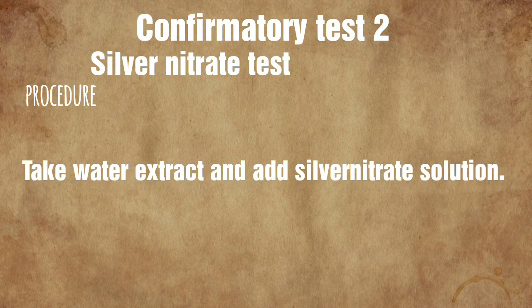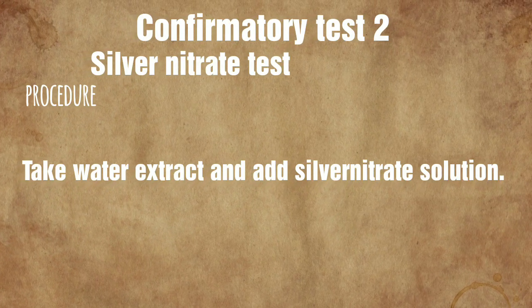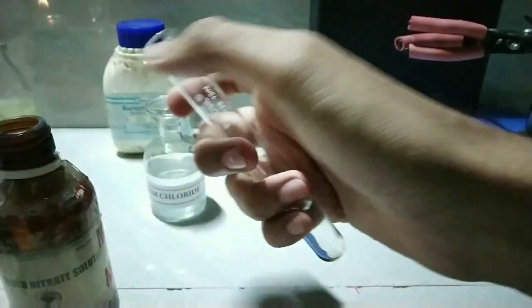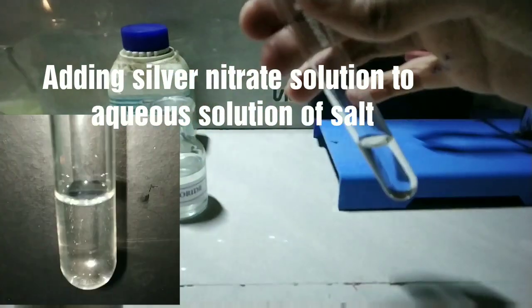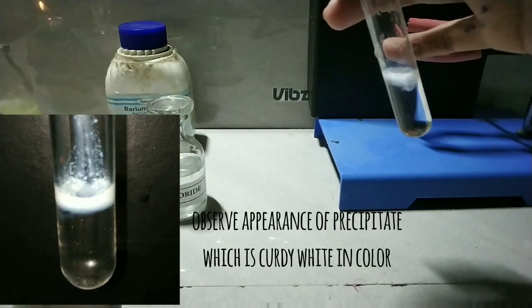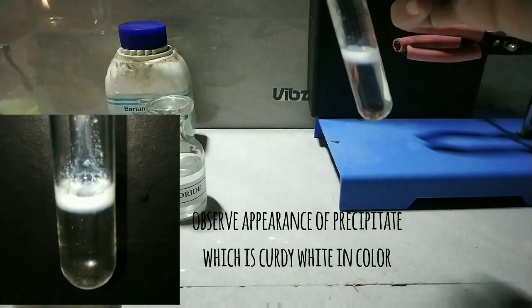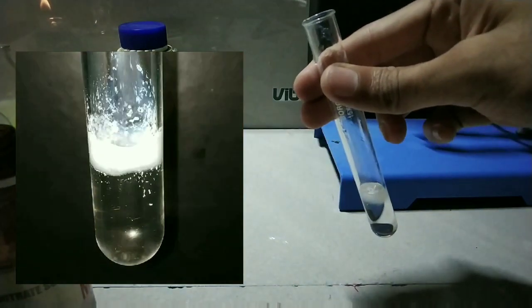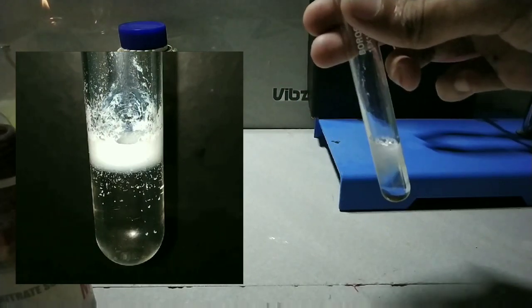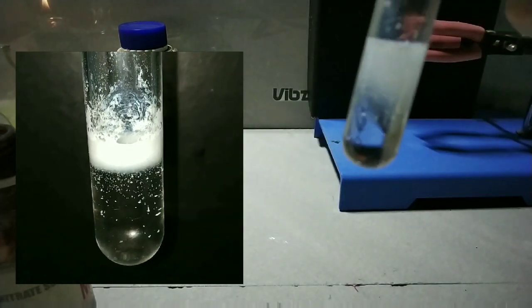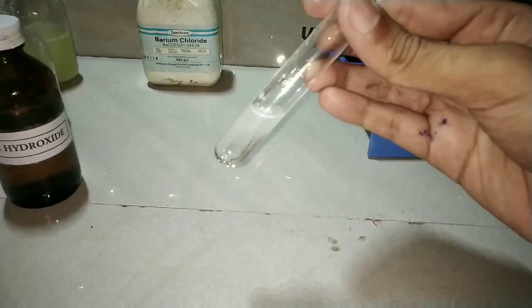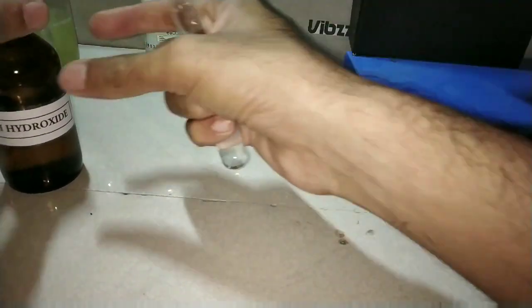The second confirmatory test is the silver nitrate test. Here we take some salt solution and add silver nitrate solution into it. I have already taken the aqueous solution of the salt and now I am adding silver nitrate solution. You can see the development of a curdy white precipitate.